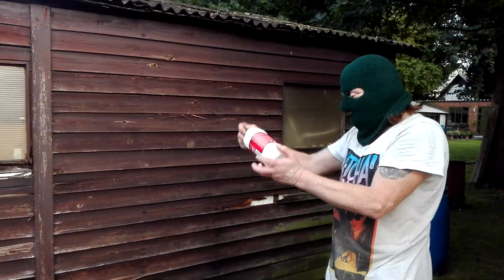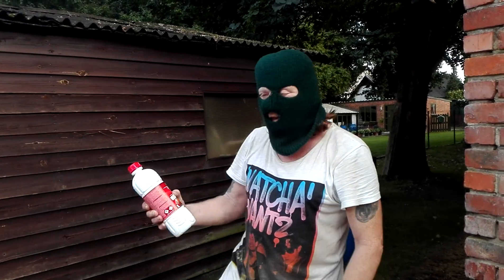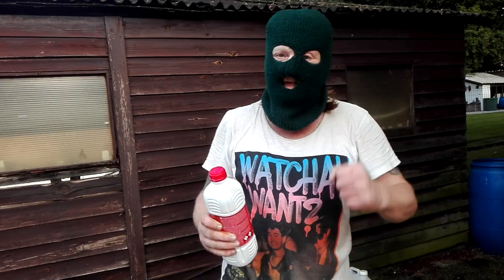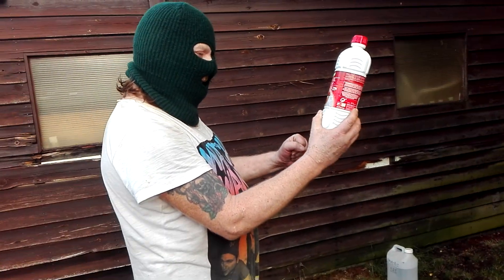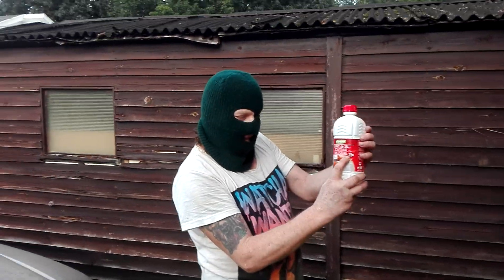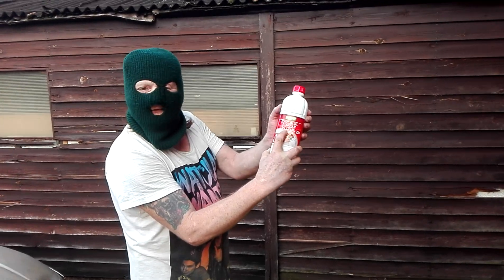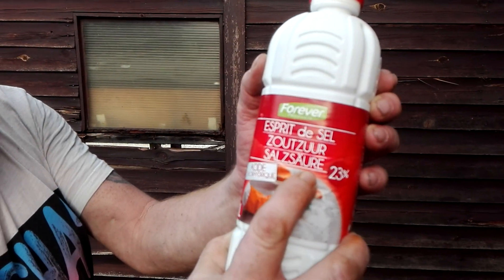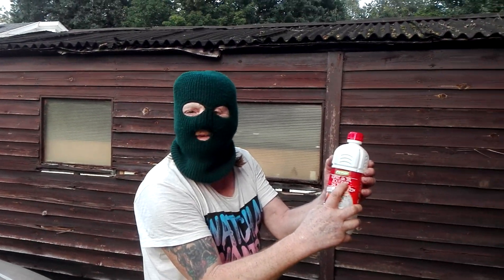The next thing we need is hydrochloric acid, also known as muriatic acid. It's only a small amount, the lower grade — it's 23%.